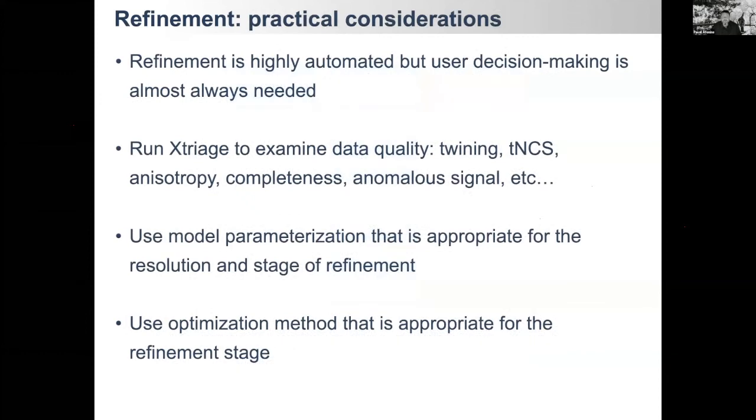Now, let's go back to Earth and think about some practical considerations when it comes to actually doing refinement in your regular routines. Here I have just a few slides of a collection of some random considerations, not a full complete list. You can bring more with your questions, obviously, but I'll go through this and hope you ask more questions about these aspects.